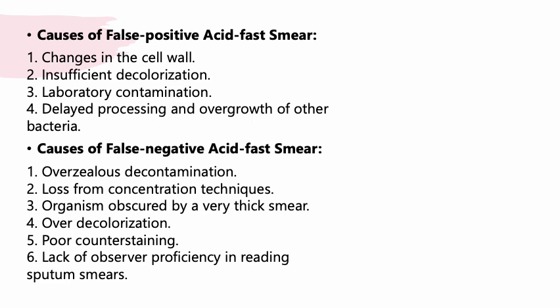Now, over-decolorization can also cause a false negative. Poor counterstaining, where you have a lesser contact time of the counterstain, so you need to observe the contact time. And lastly, the lack of observer proficiency in reading sputum smears, where you overlook the red bacilli in your smear.